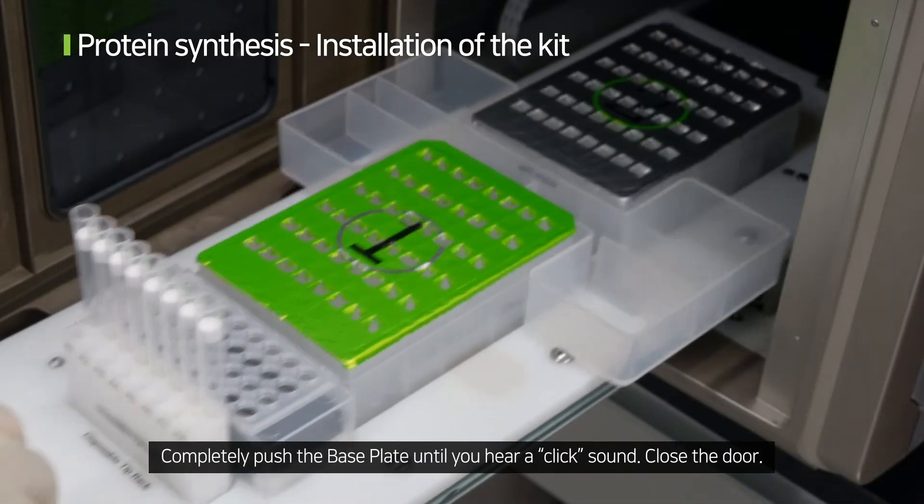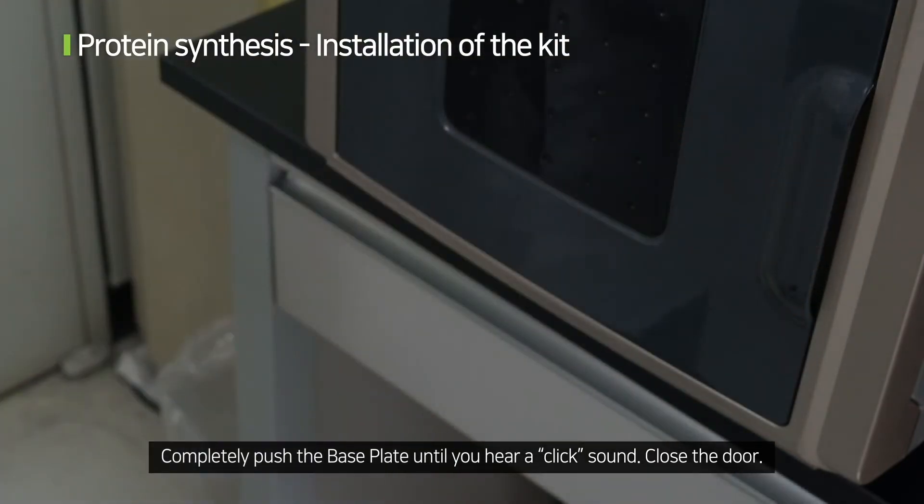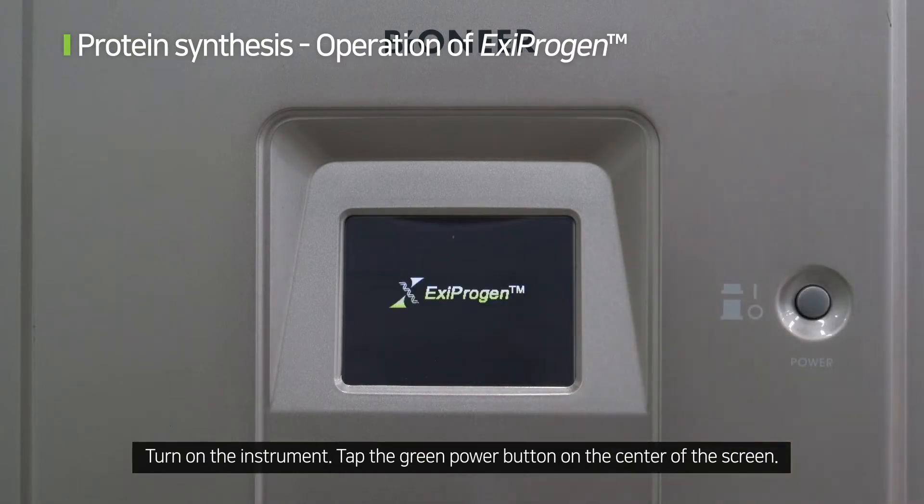Xiprogen can now be used. Completely push the base plate in until you hear a click sound, then close the door. Turn on the instrument and tap the green power button on the center of the screen.